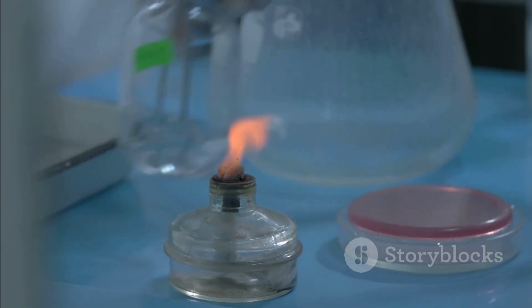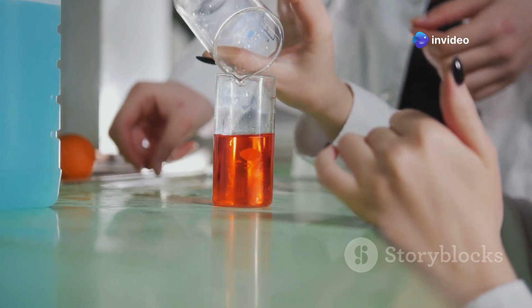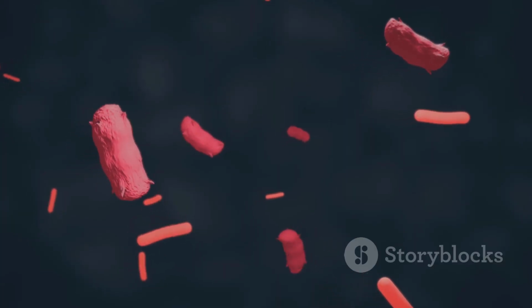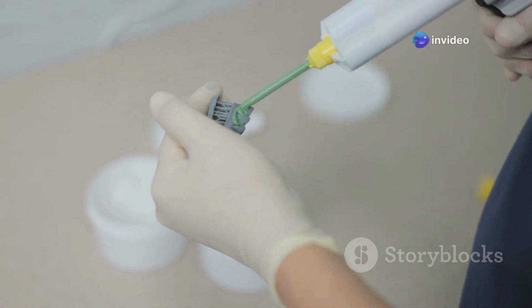Next in line is iodine, our mordant. Now, mordant might sound like something out of a Harry Potter book, but it's simply a substance that helps fix the dye onto the bacteria. It forms a complex with crystal violet, making it less soluble and more likely to stick around. Think of it as the glue that makes the color stick.